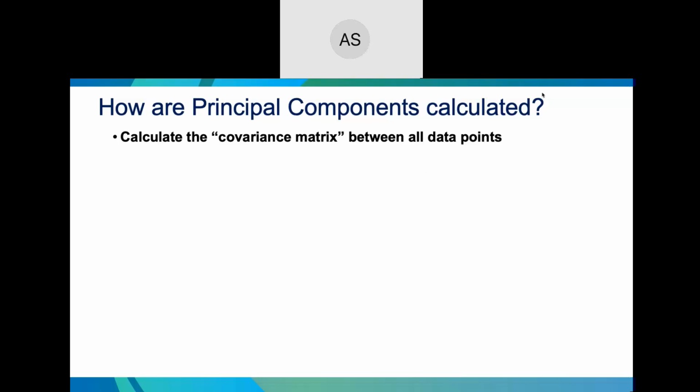Okay, so before we get into the rest of the statistics lecture, I wanted to go over a really high-level explanation of how we calculate principal components. Yesterday, Kevin and Yuval alluded to a whole bunch of linear algebra, which is true. The big idea behind principal components for PCA is simply being able to summarize all of the variance in the data set in several informative vectors. So what do I mean by that? How do we do that?